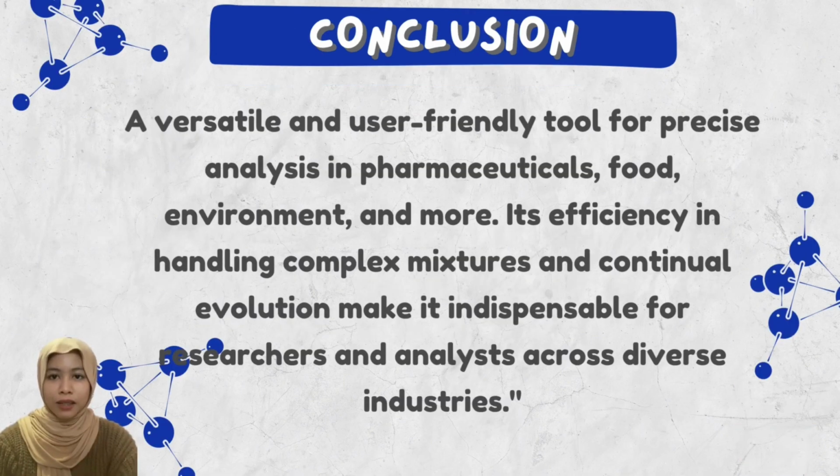In conclusion, HPLC stands out as a versatile and user-friendly analytical tool with widespread application in pharmaceuticals, food analysis, environmental monitoring, clinical diagnostics and chemical research. Its efficiency in handling complex mixtures and providing high sensitivity and selectivity makes it indispensable for researchers and analysts. The ongoing evolution of HPLC technology ensures its continual relevance in addressing diverse analytical challenges across various industries.